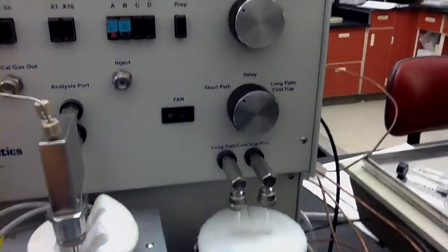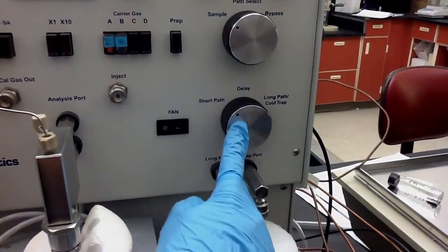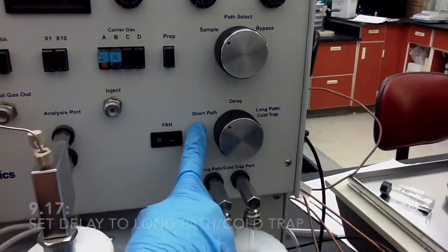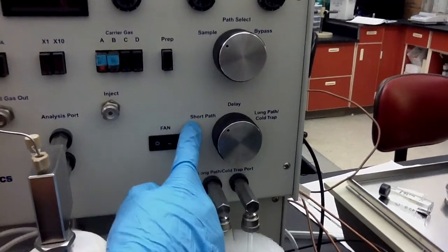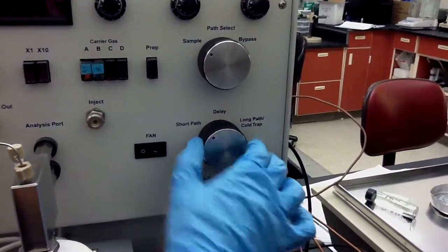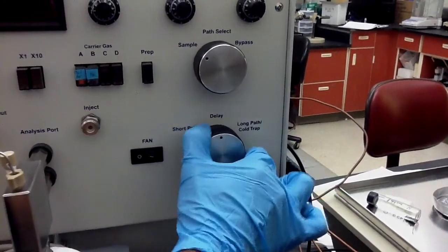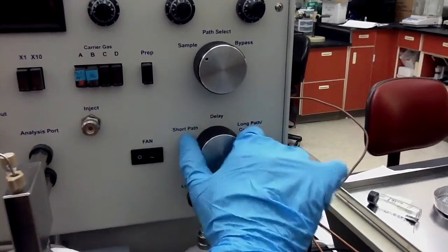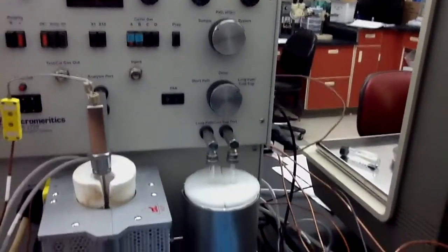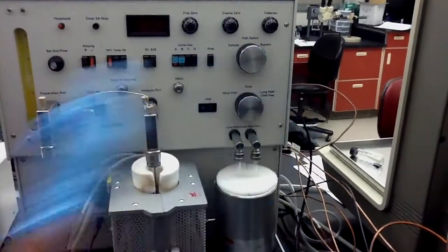cover here. So when you want to use this cold trap, you have to change this valve between these 2 different locations. If you select this short path, it will not go through this cold trap, it will go directly to the TCD. If you want to use the cold trap, you have to select this one back to long path cold trap. So now the gas will go through this and condense all the water here, and dry gas will go to the TCD.